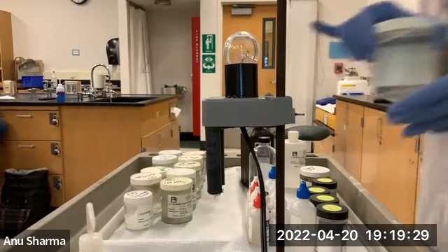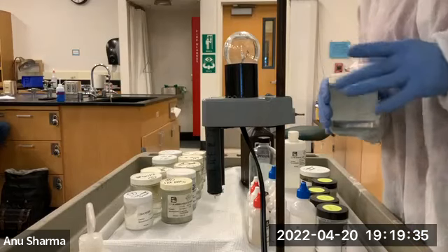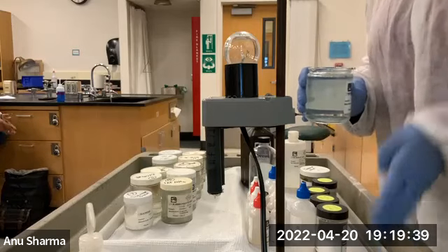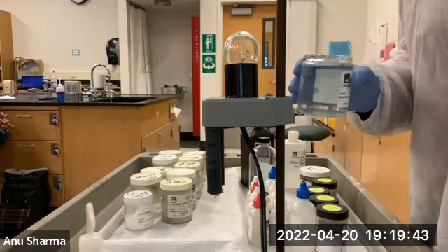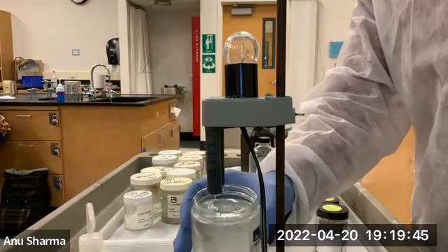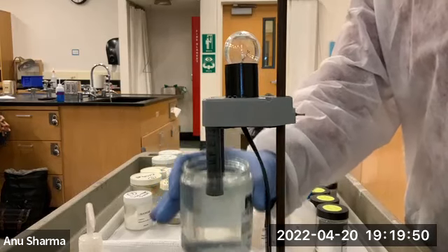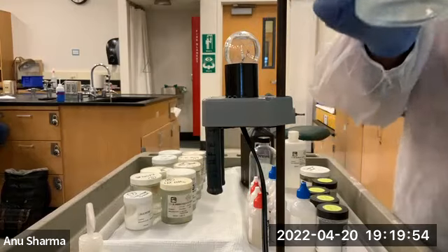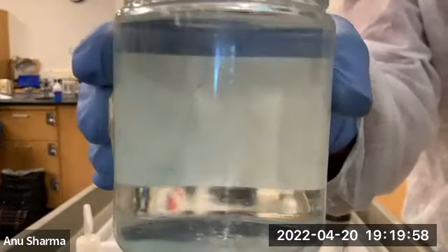Next is number 8. When you take sucrose, a sugar, and mix it in water, it again contains a lot of OH groups, but these OH groups are not available for conducting electricity. Sucrose is soluble in water because lots of OH groups dissolve in water.